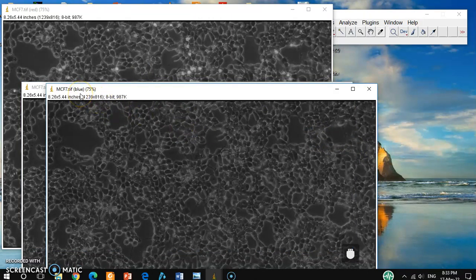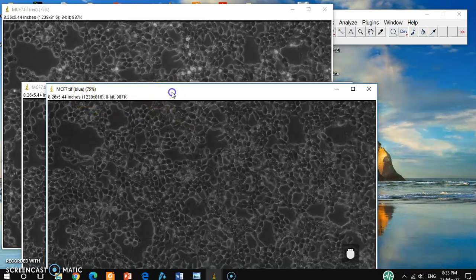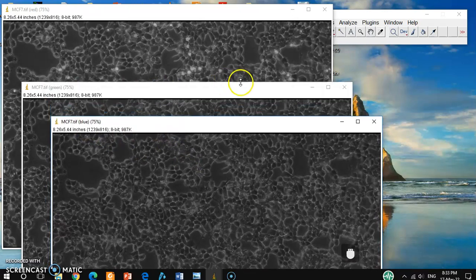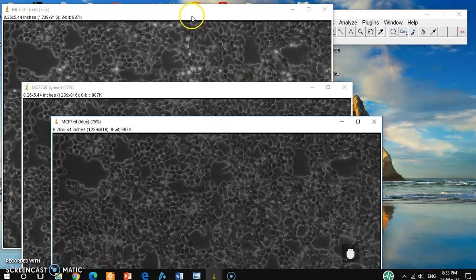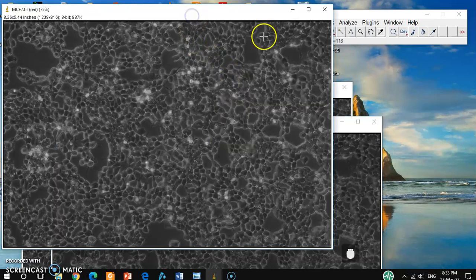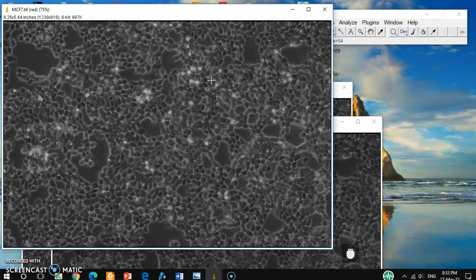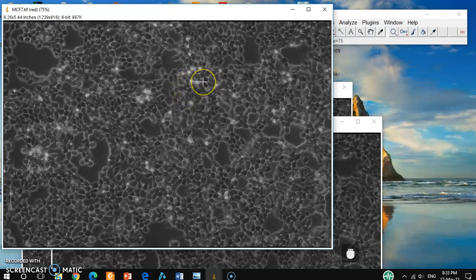Okay, so you can close the red one because you can see here, this is the red and bright field pictures merged together, that's why red cells, the intensity is quite higher. So you can close this one.